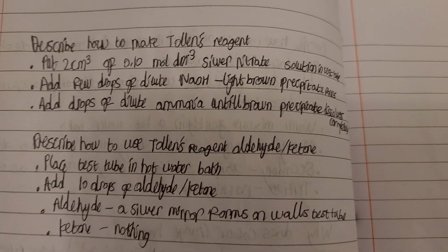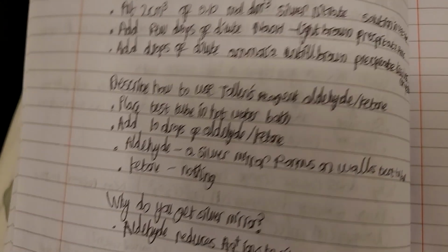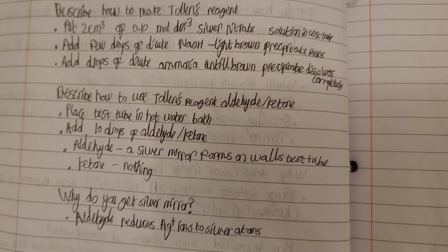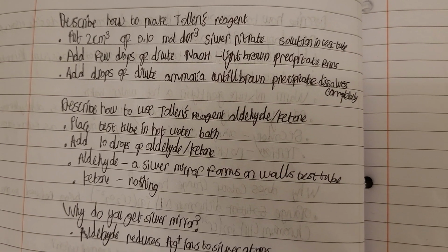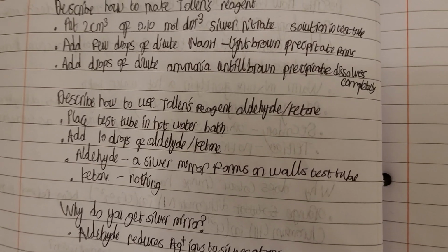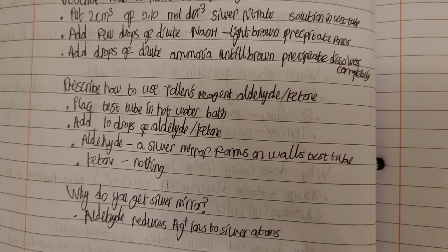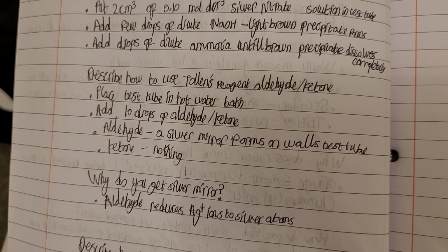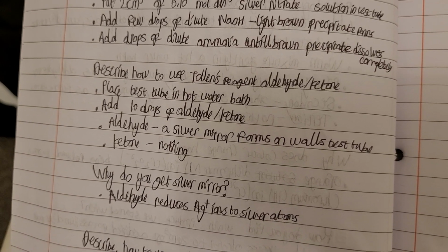Describe how to make Tollens' reagent. Put 2 centimeters cubed of 0.10 mol dm-3 silver nitrate solution in a test tube. Add a few drops of dilute sodium hydroxide. When we add the few drops of dilute NaOH, a light brown precipitate forms. Then add drops of dilute ammonia until the brown precipitate dissolves completely. So that's how you make Tollens' reagent.